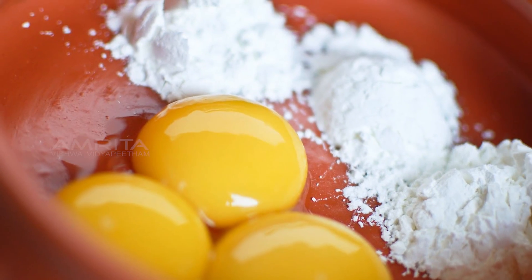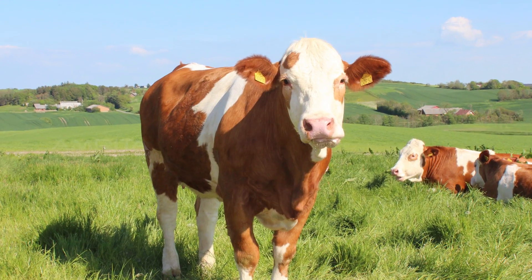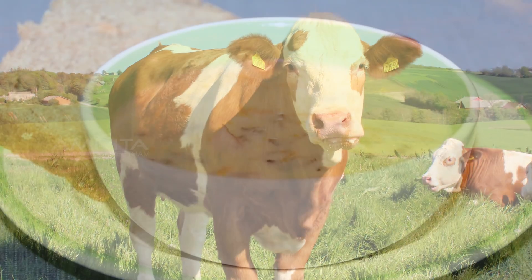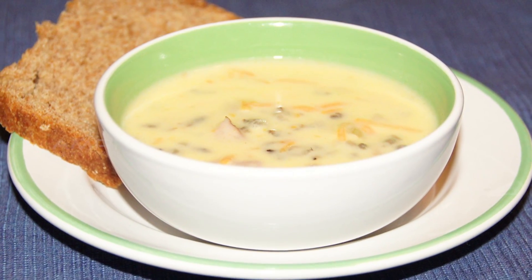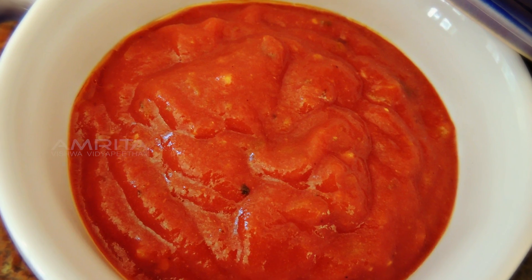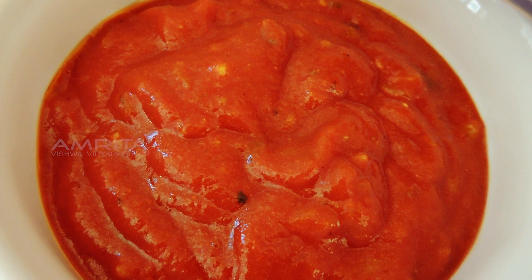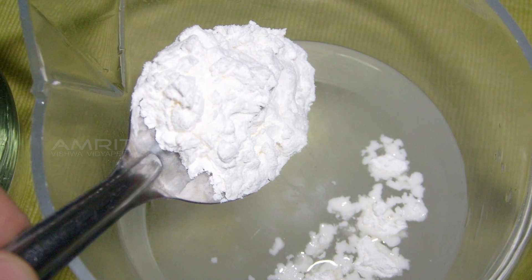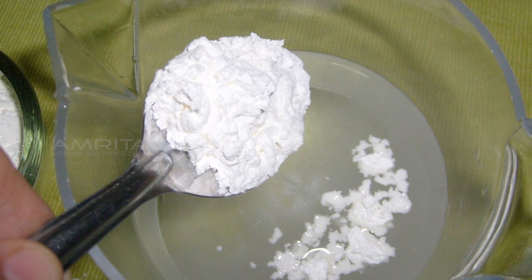Starch is naturally abundant storage form of carbohydrate in plants and animals. Starch is a polysaccharide carbohydrate consisting of a large amount of glucose monosaccharide. Natural starches are mixtures of amylose and amylopectin.